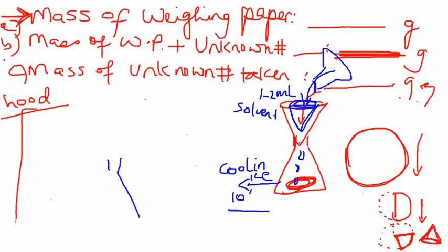So we'll set up a filtration funnel. It has two parts, which, if not constrained, if not put together, and if you don't use your index finger to hold it, it can fly away.